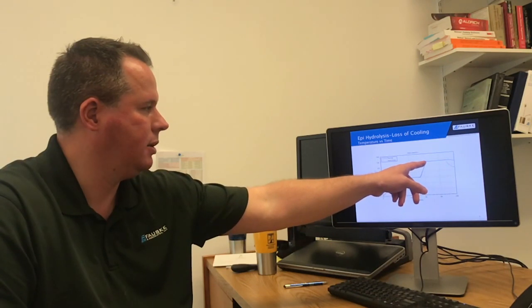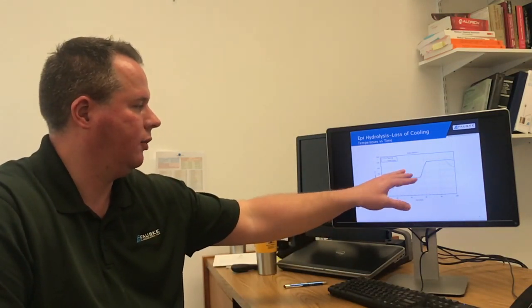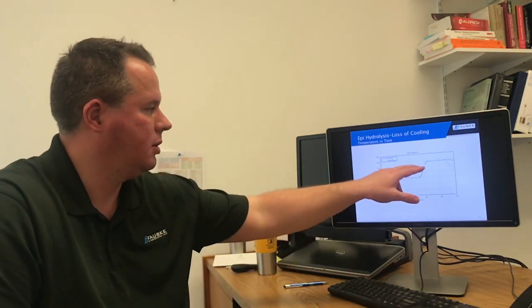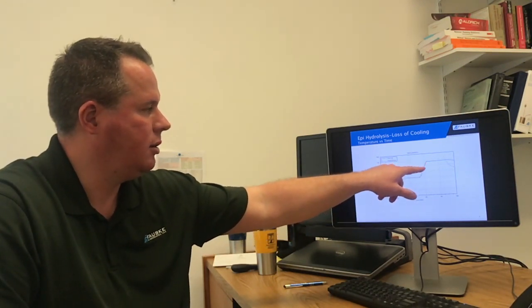80 degrees up to about 136 degrees C. And so not only is it heating the water and nitric from 80 C to 136 C, but it's also heating the epi from room temperature up to 136 C. So when we stop the addition, you can see that the reaction is pretty much over. It's no longer generating heat, and the temperature just remains constant.